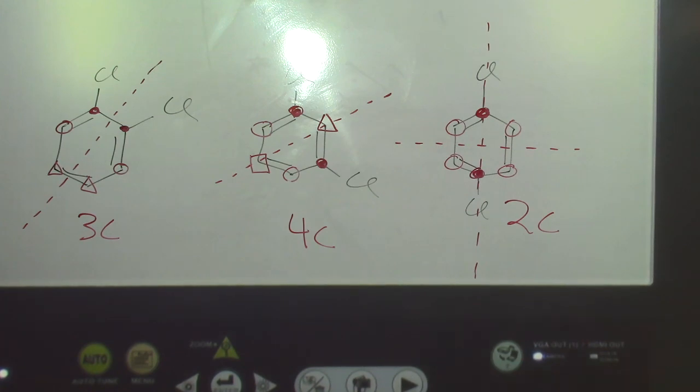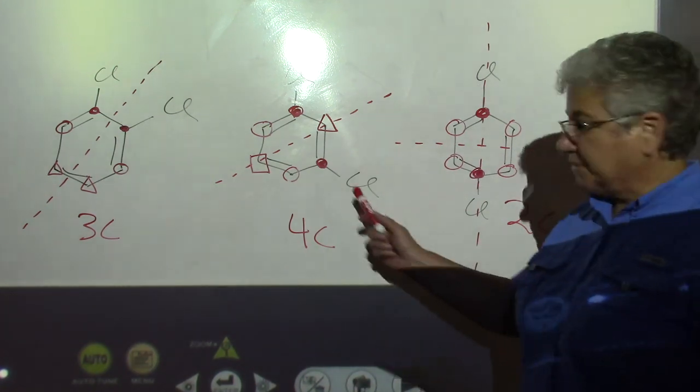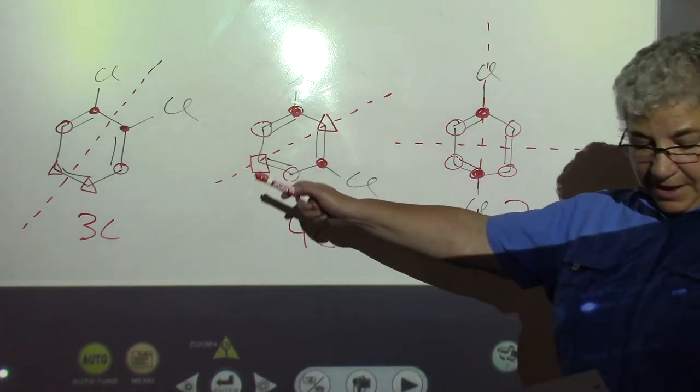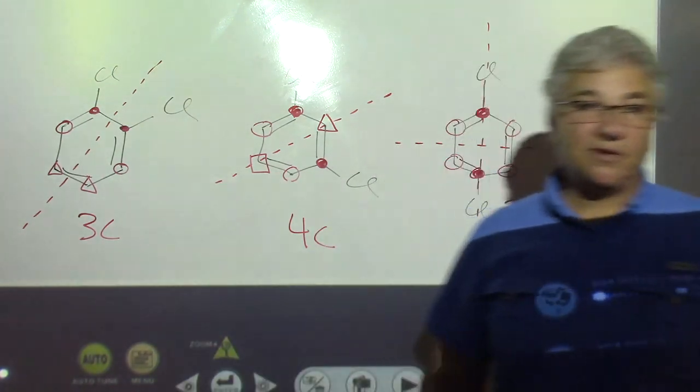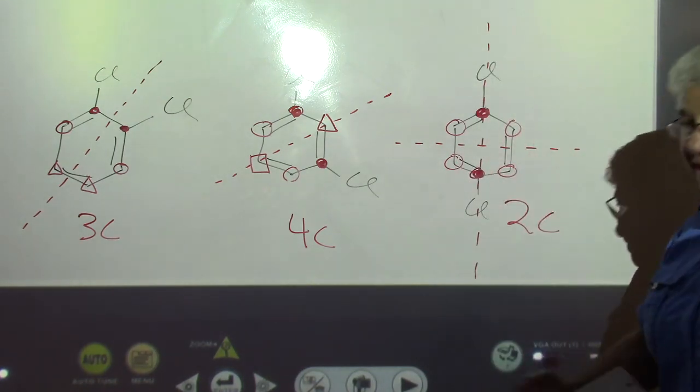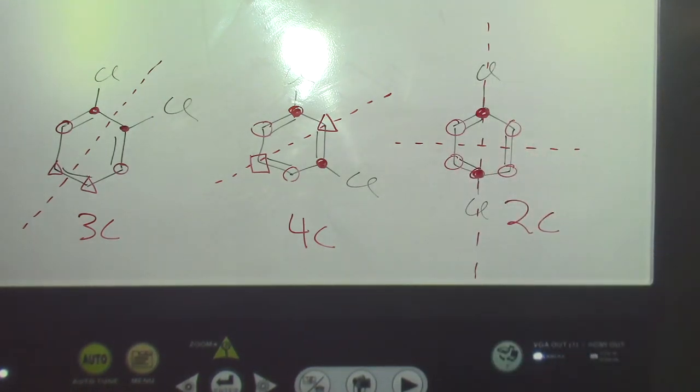So your middle spectrum does have 4 peaks on it, so it would be B, and your bottom spectrum has 3 peaks, and so that would be A. So that would be C, B, A as you go down the list. All right, that is symmetry, right? Symmetry is important.